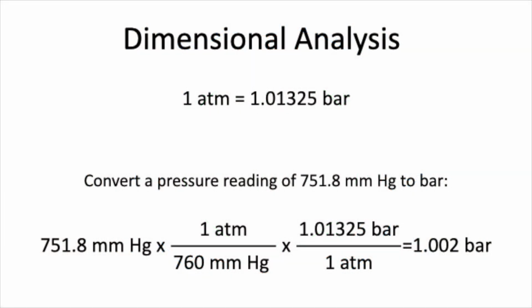You can read the important information in the box to the right of the conversion factors. The conversion factors are all exact numbers, which have an infinite number of significant figures. Therefore, the number of significant figures in a converted value will be dependent upon the number of significant figures in the barometer reading. I'll do an example conversion.